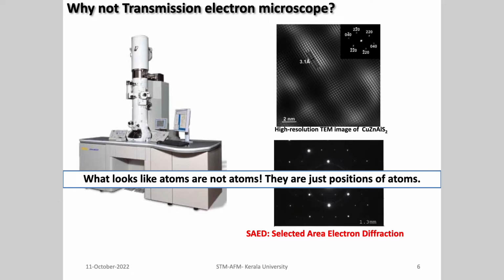And diffraction is a Fourier transform, I mean, we call it like that. Mathematically speaking, what you see here is basically the structure of the grating, which is the crystal. If you see hexagonal like this, that means the crystal also has hexagonal symmetry. It may be graphene or graphite or something like that.